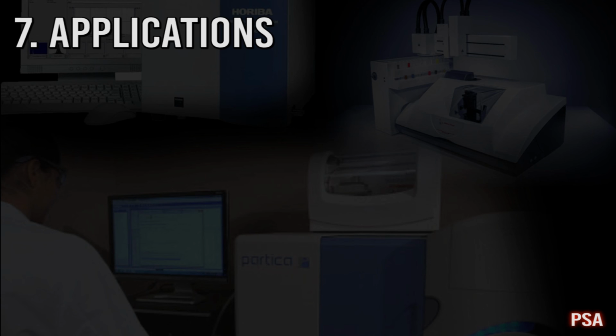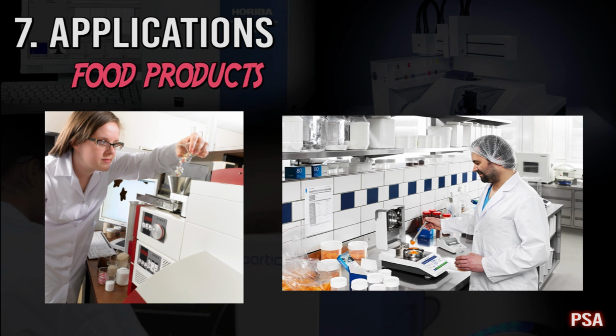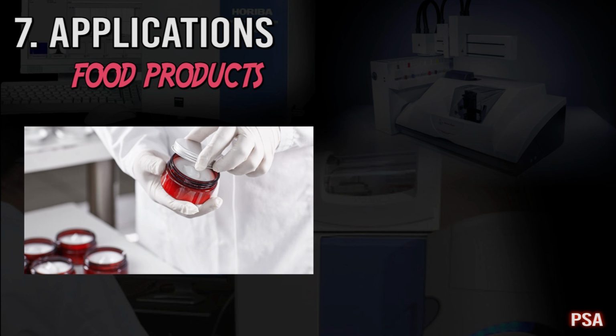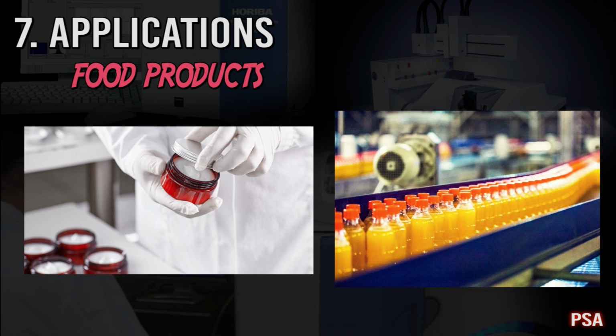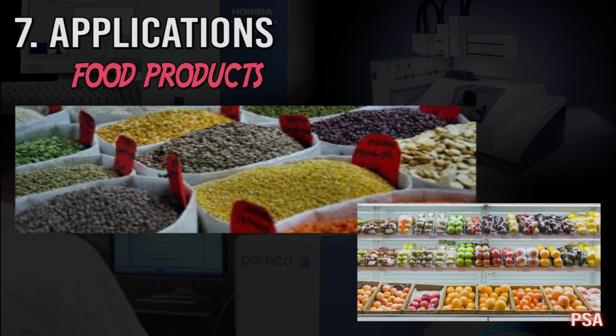For its application in food products, the utilization of the particle size analyzer led to molecule innovation that has been effectively applied in the food business. By controlling the particle size distribution in beverages, it plays an important role in ensuring the consistent quality of it. Thus, the size distribution of the particles can influence the taste, appearance, and stability, which will give a good end result for the food product.